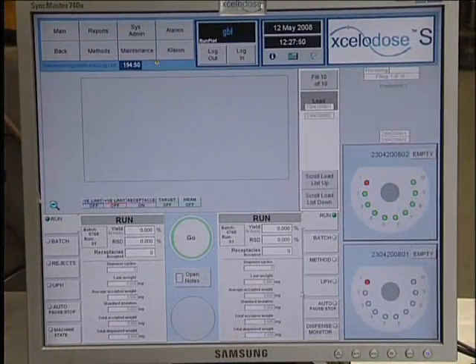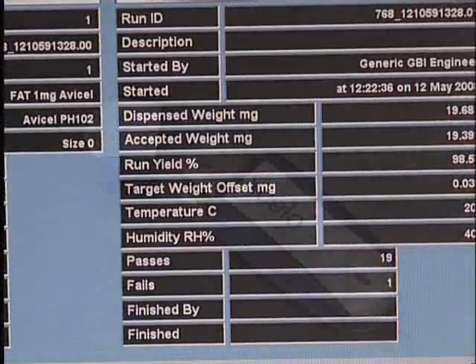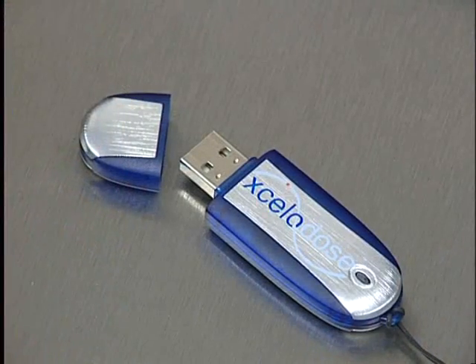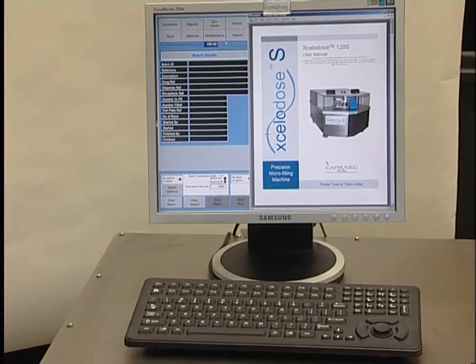The Accelidose 120S system features more software functionality, in particular improved data transfer, tighter user security and the ability to access the user manual on screen.